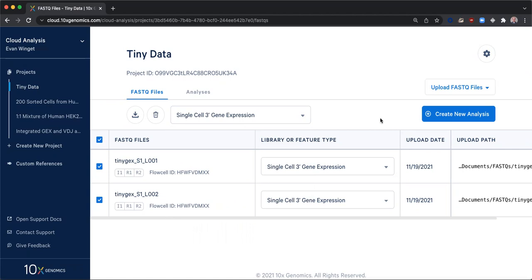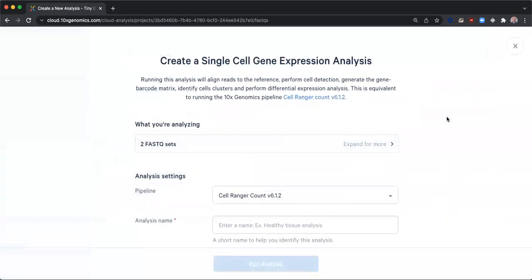CellRanger pipelines, with the exception of CellRanger agr, expect that all input files correspond to a single gem well. After clicking create new analysis, I am routed to the setup form.